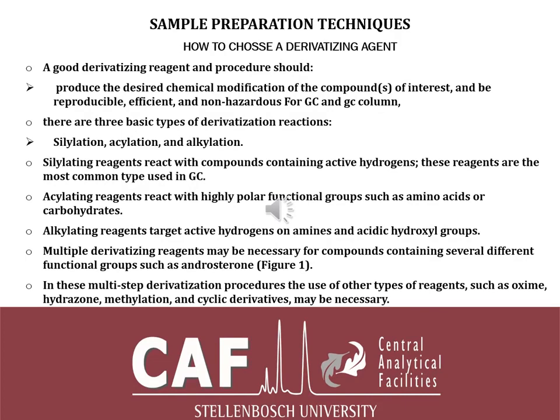Before doing derivatization, it is important to understand and know what to consider before choosing a derivatizing agent. A good derivatizing agent and procedure should produce the desired chemical modification of the compound of interest, and be reproducible, efficient, and non-hazardous for the GC and the GC column.